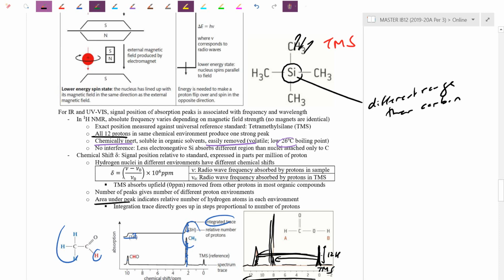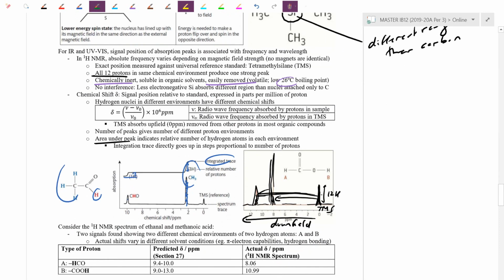For chemical shift, they go into a little bit more detail. They measure it based on TMS, so they give you a number for that. If you compare it to your data booklet, we find that the data booklet gives us a huge range. It's not super easy, but if you can match it up, this one here is the best because it identifies not just, oh, I might have this bond, it actually has this bond in this environment where the hydrogens on my neighbors are in a certain fashion.